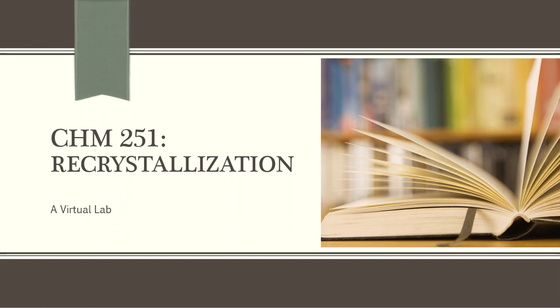So, with that said, our next lab experiment is recrystallization. And recrystallization is a very common laboratory technique in organic laboratories. So this is another reason that we start off the semester with recrystallization, or at least a proper organic class should start off with something like recrystallization in the beginning.